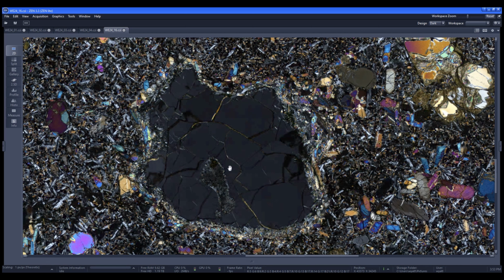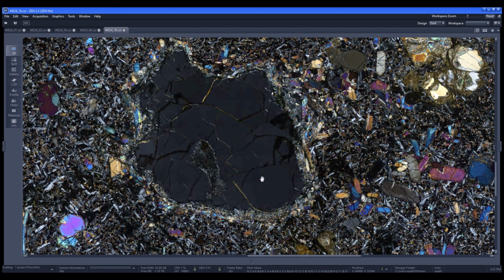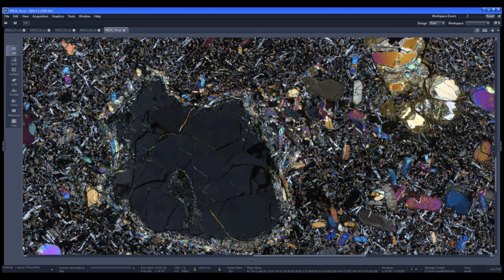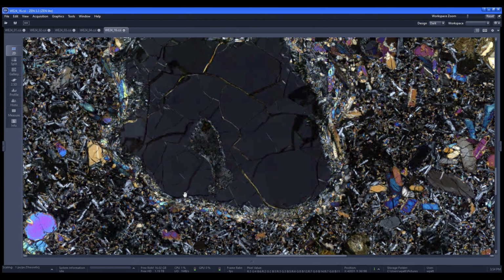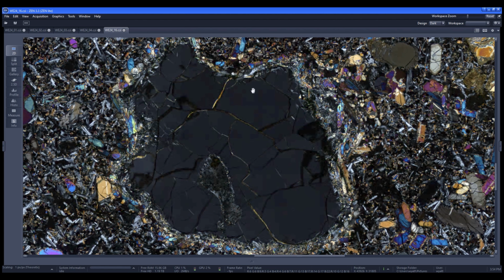Now, quartz is not going to be typically in a basalt. This did not form in the magma, but it got pulled into it, either as the magma was flowing on the surface or as the magma was racing up through the earth, through the country rock, whether that be metamorphic or igneous or sedimentary. It got pulled into the magma. Now, quartz is high in silica. Mafic magmas, like basanites, are low in silica, and that difference causes a chemical reaction to occur.